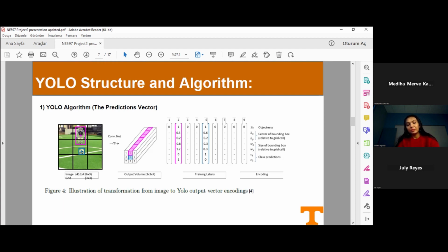That bounding box is a spatial position in the image. We can say it's an imaginary rectangle that it predicts, but then it will optimize the prediction based on the training, and there it uses regression.